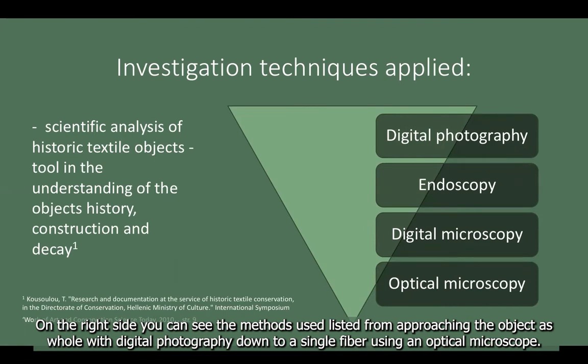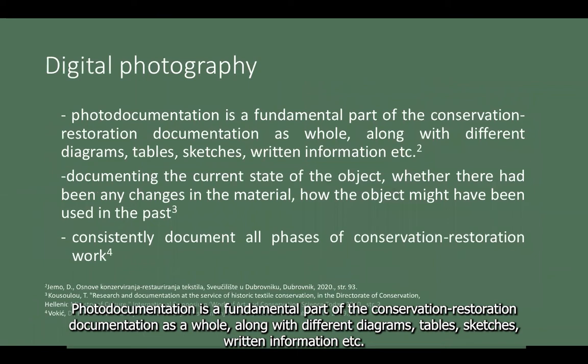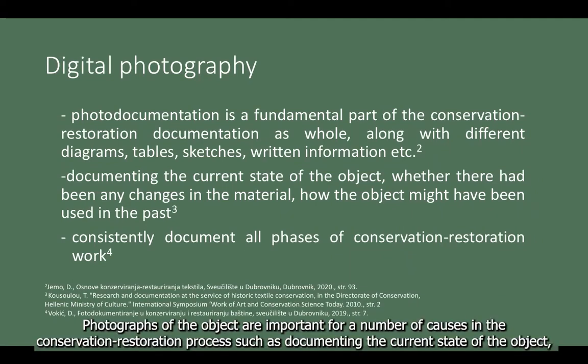On the right side, you can see the methods used, listed from approaching the object as a whole with digital photography, down to a single fiber using an optical microscope. Photo documentation is a fundamental part of the conservation restoration documentation as a whole, along with different diagrams, tables, sketches, written information, etc.